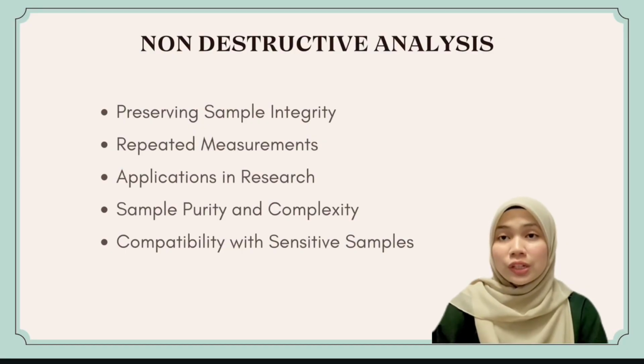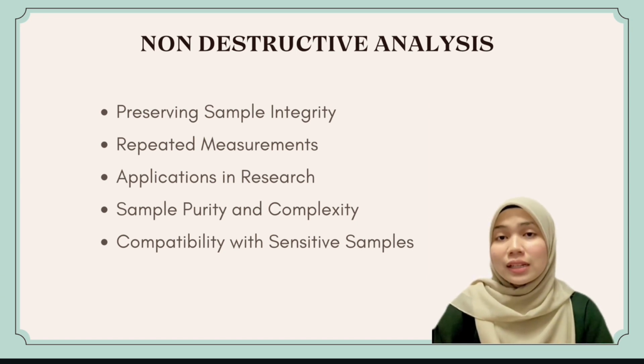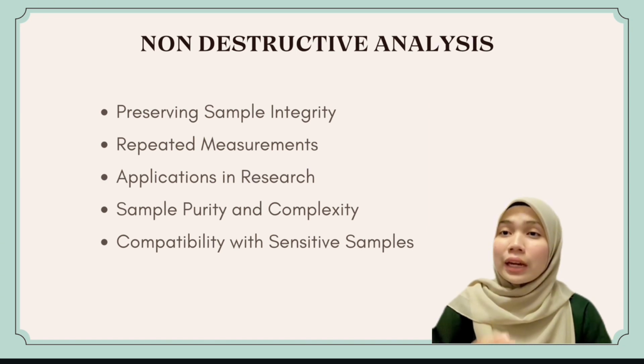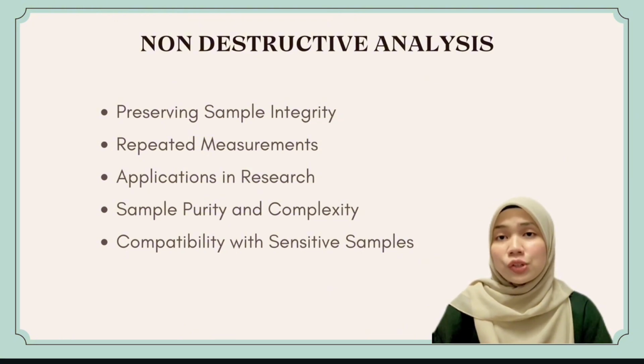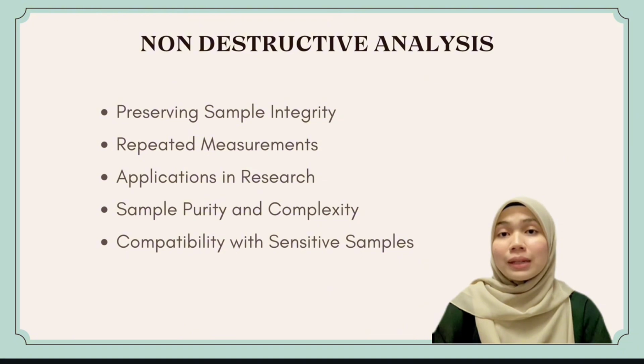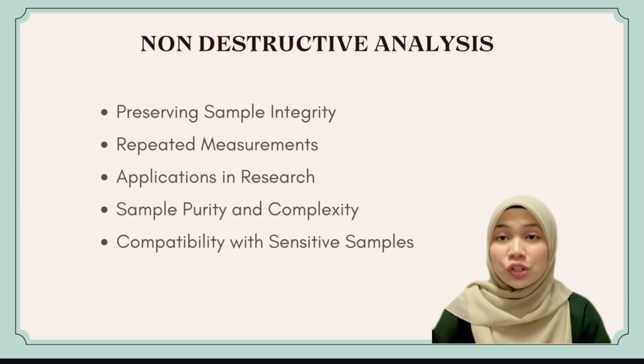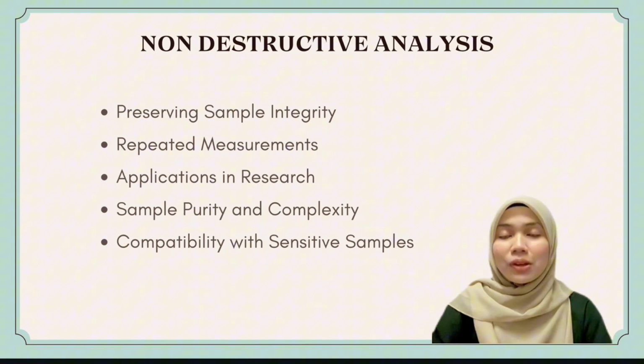The first feature is that nuclear magnetic resonance is a non-destructive analysis. NMR spectroscopy is characterized by its ability to extract information from a sample without altering or damaging it. This preservation of sample integrity is particularly beneficial for delicate or limited samples, ensuring accurate molecular level representation. The non-invasive nature of NMR allows for repeated measurements on the same sample, facilitating extensive data collection, result verification, and experimentation under varied conditions without depleting the original material.